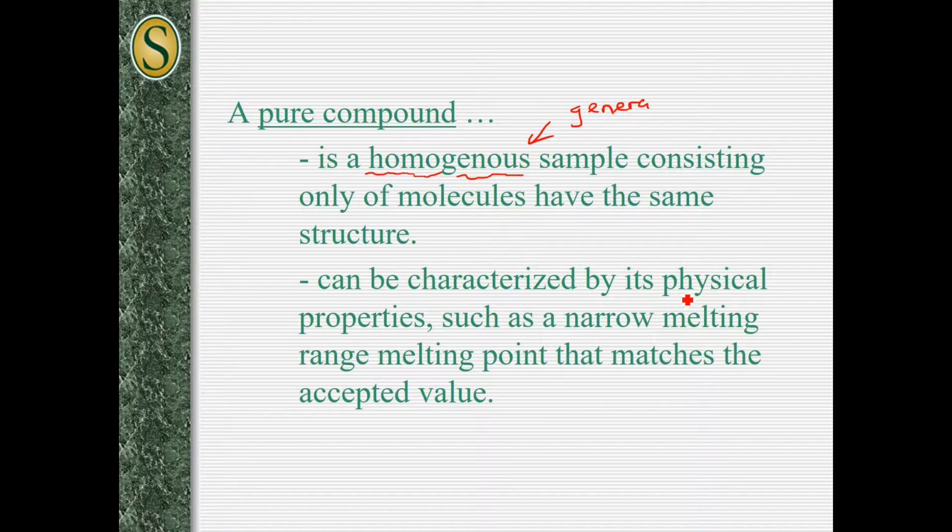Once it's pure, we will let it dry, and then we'll assess purity using melting point. Melting point is a physical property that we can take advantage of to check for purity. If it's pure, it usually has a narrow, sharp melting point range. But if it's impure, the melting point range found from the experiment is going to be lower than quoted in literature or online. That will be for experiment 2.